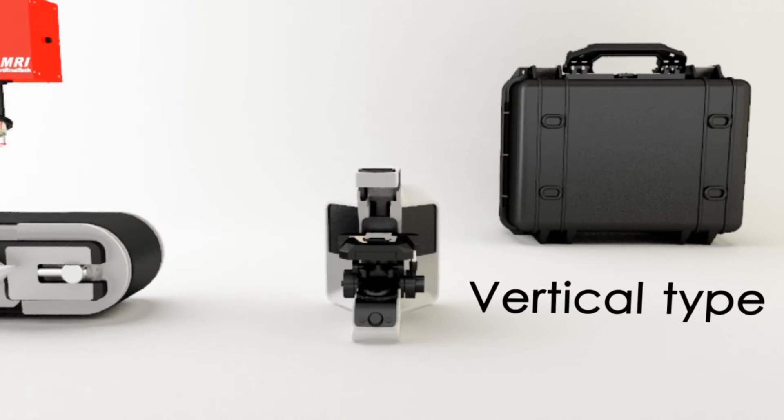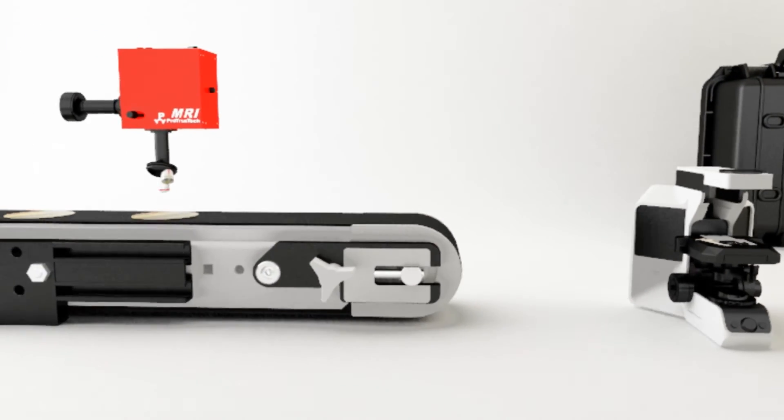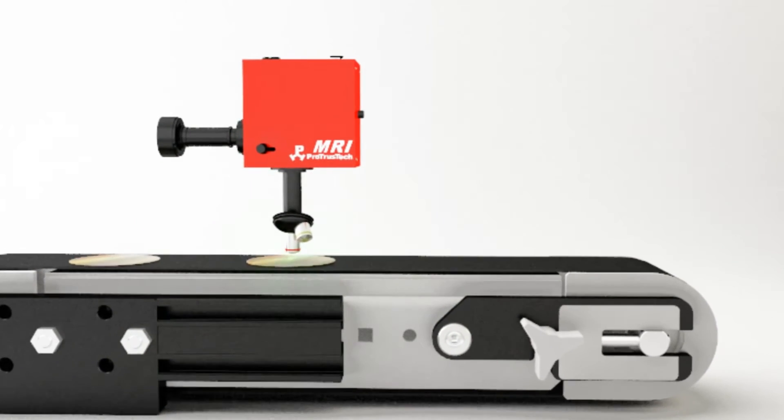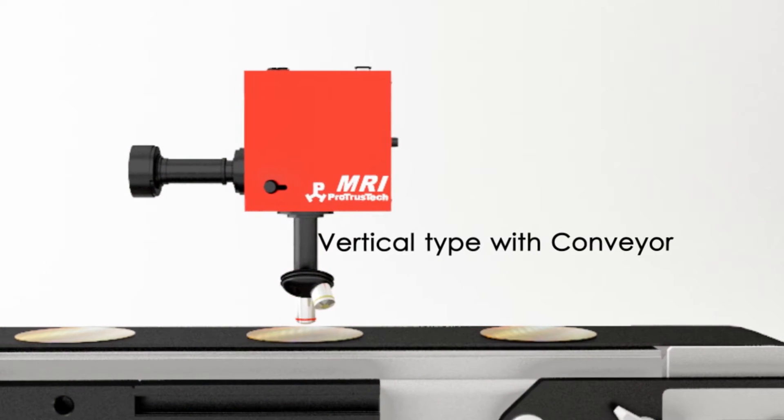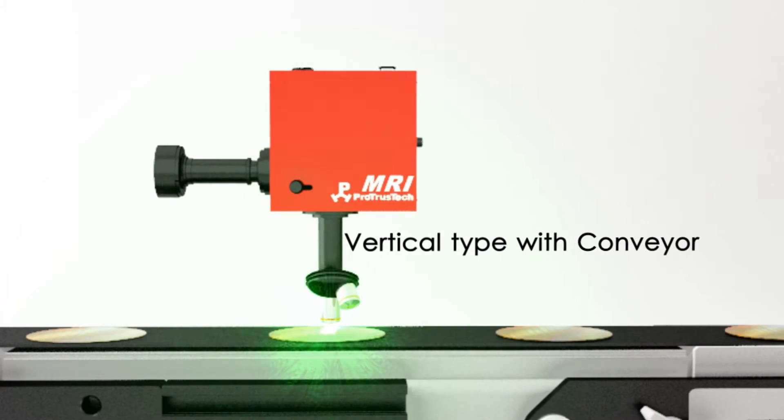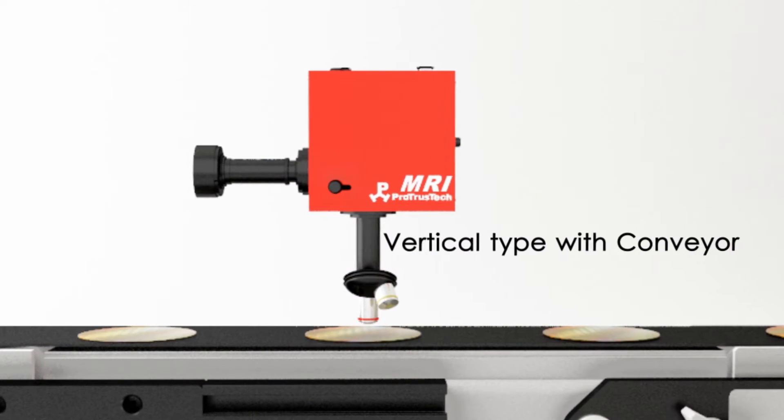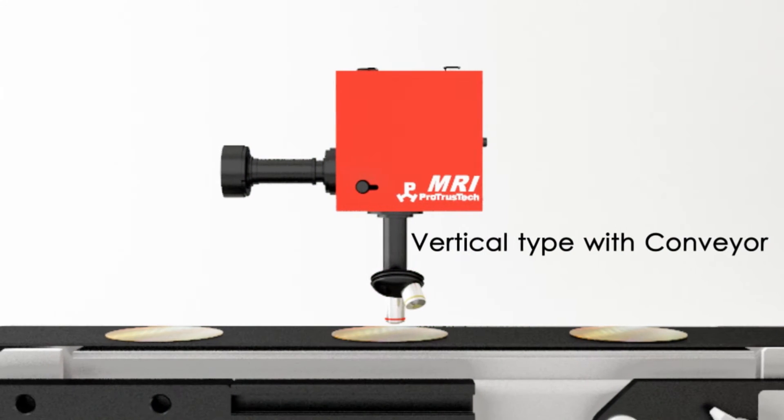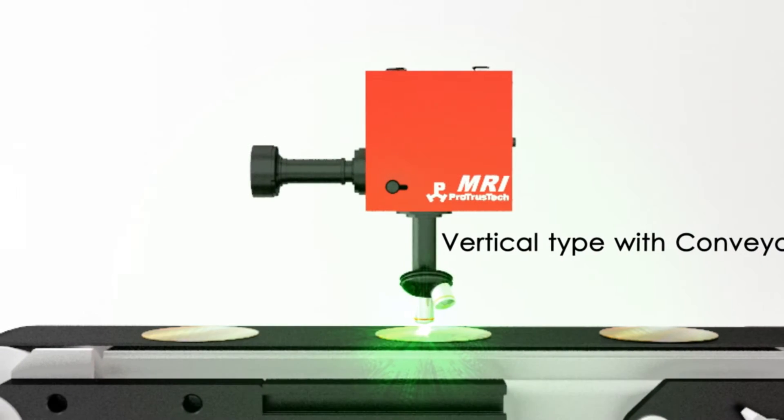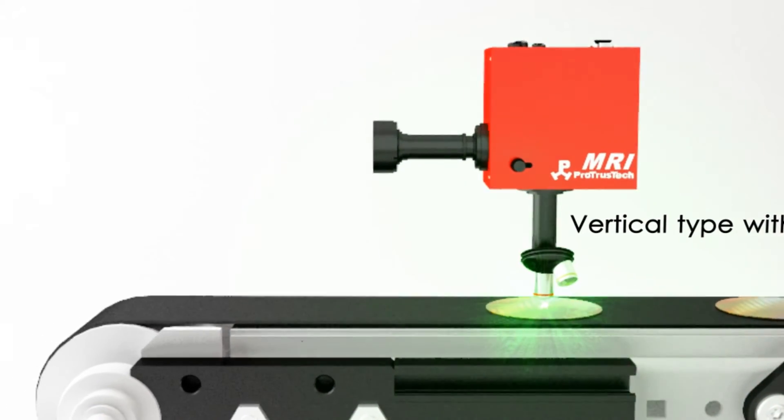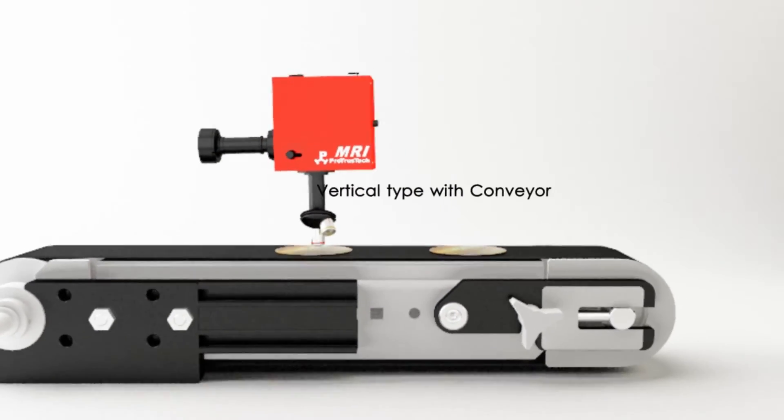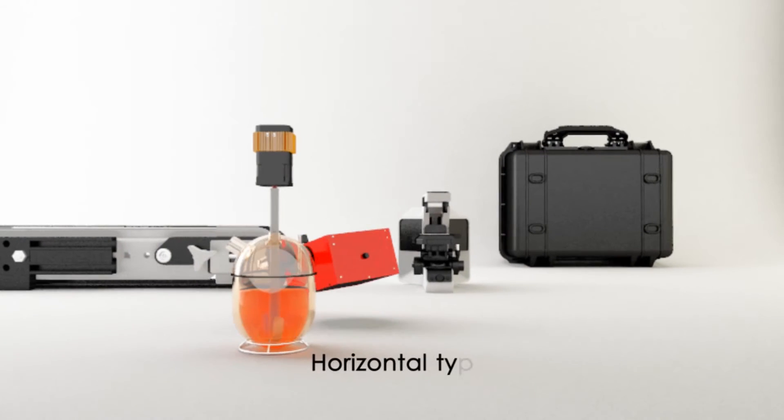In addition, since the optical module is independent from the microscopic carrier, you can assemble the individual parts together in the way that suits your preferred application best. Examples include setting up MRI within the production line to undergo real-time monitoring, detect samples of larger quantity, and can even place MRI horizontally to fortify chemical reactions online monitoring.